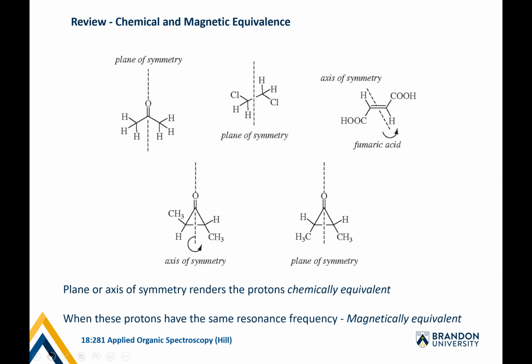Okay, now we sort of did this a little bit before, about chemical equivalence. I don't know if we talked a whole bunch about magnetic equivalence, but we will do that as part of this.